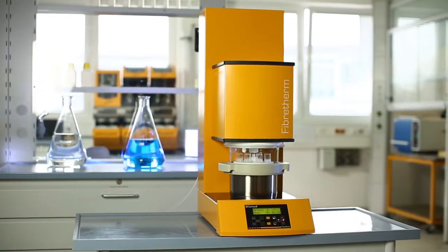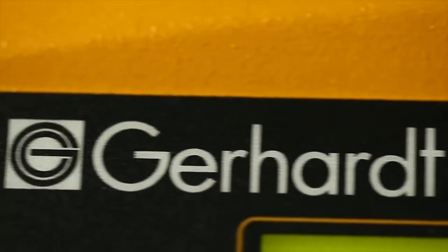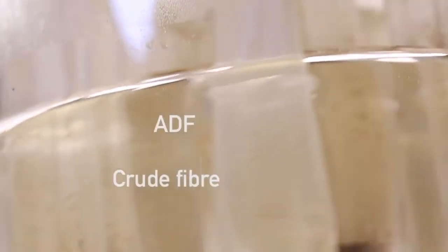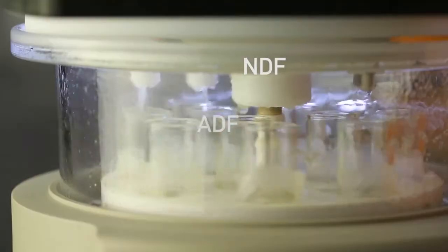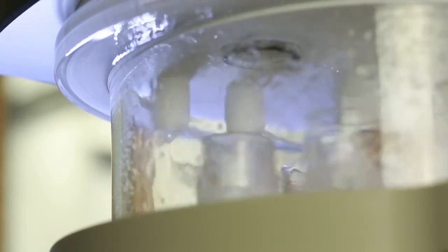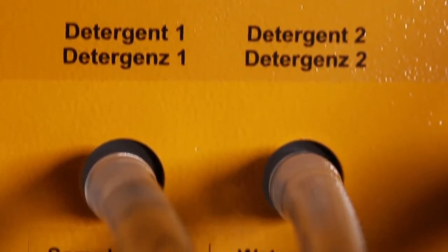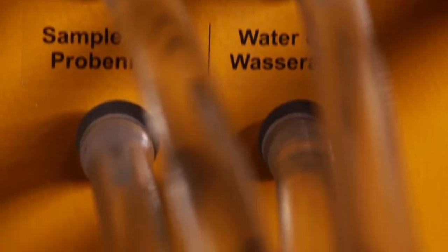Fiber-therm handles all digestion and filtration processes for the determination of crude fiber, ADF, and NDF fully automatically. For this purpose, the samples in the digestion vessel are continuously agitated. All detergents are automatically dozed by calibrated pumps.